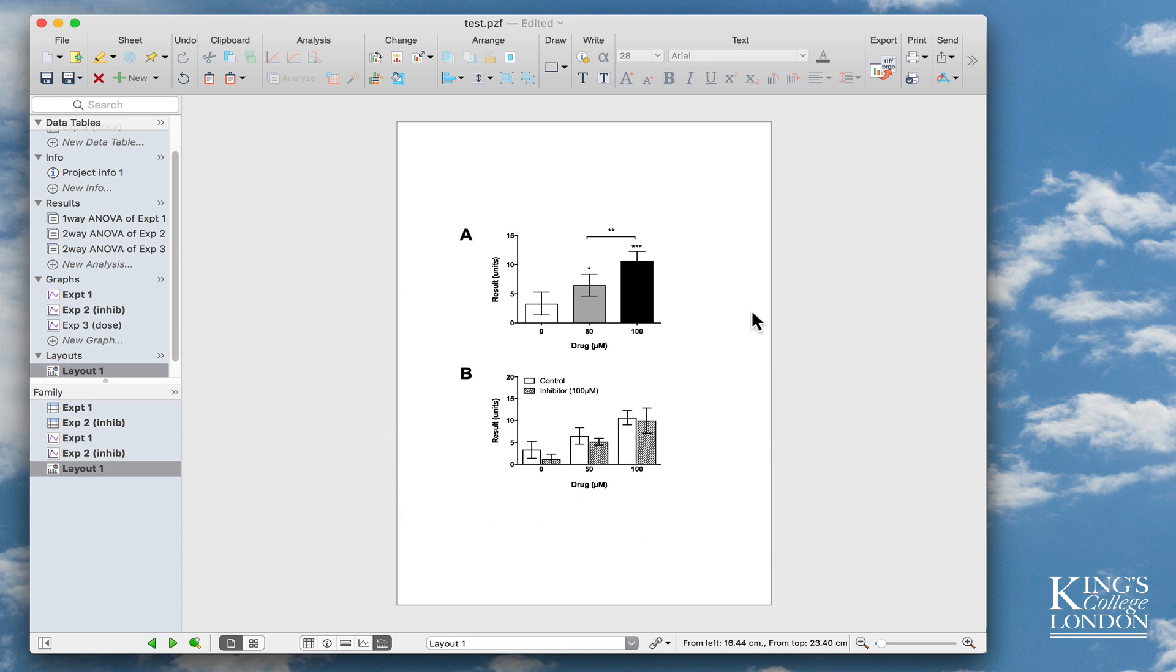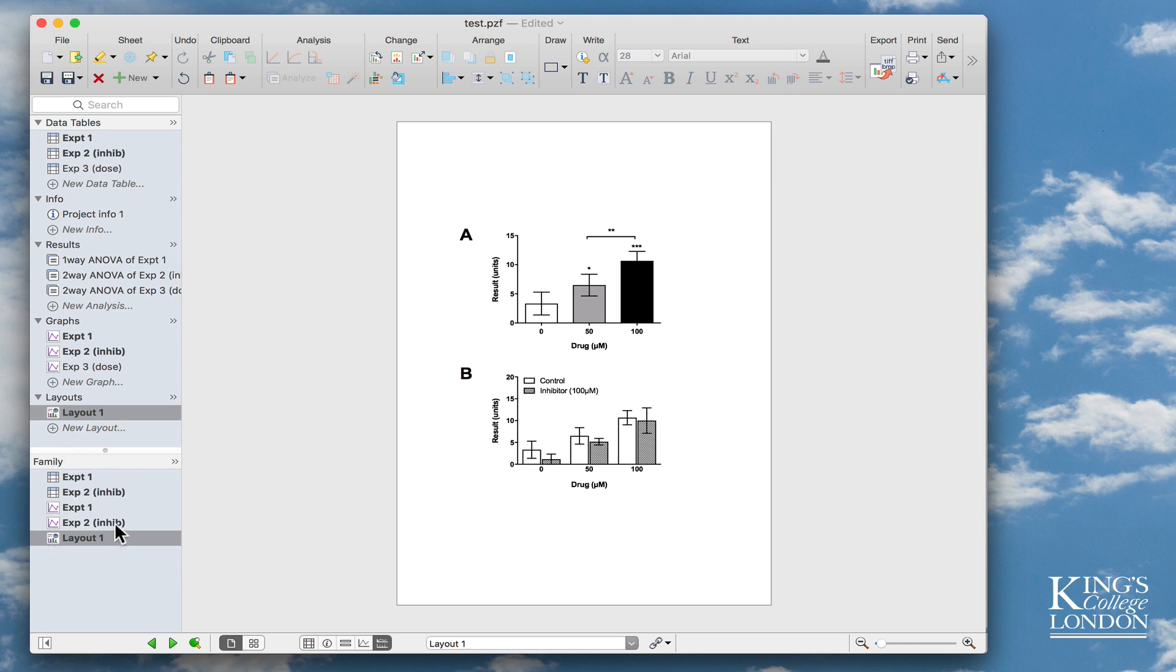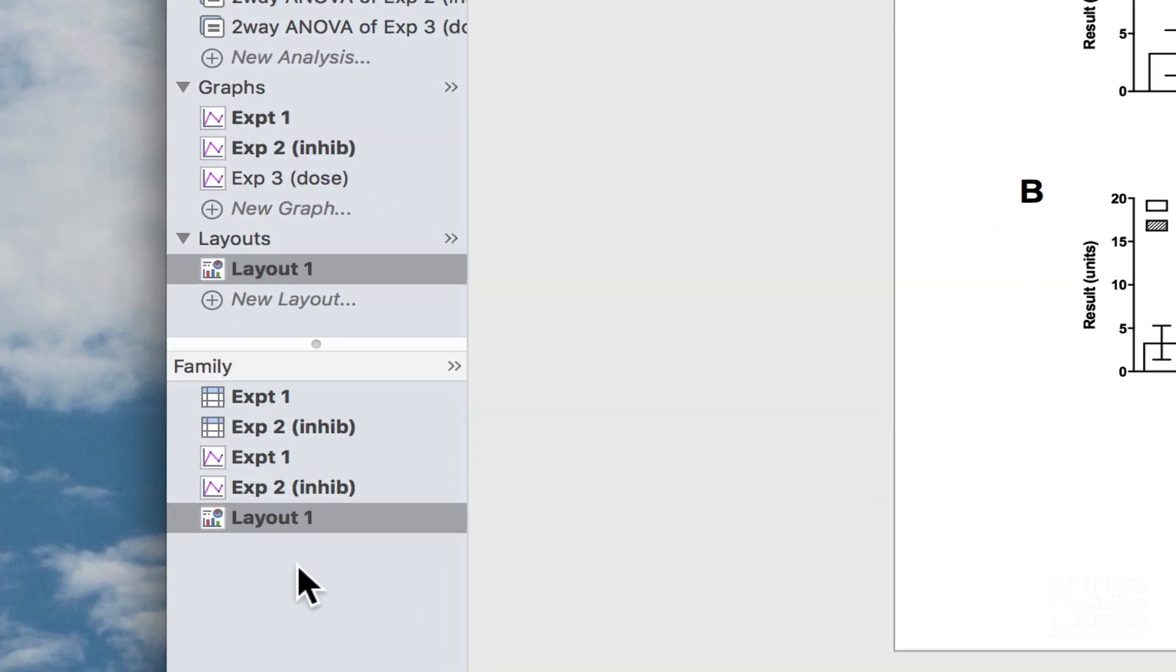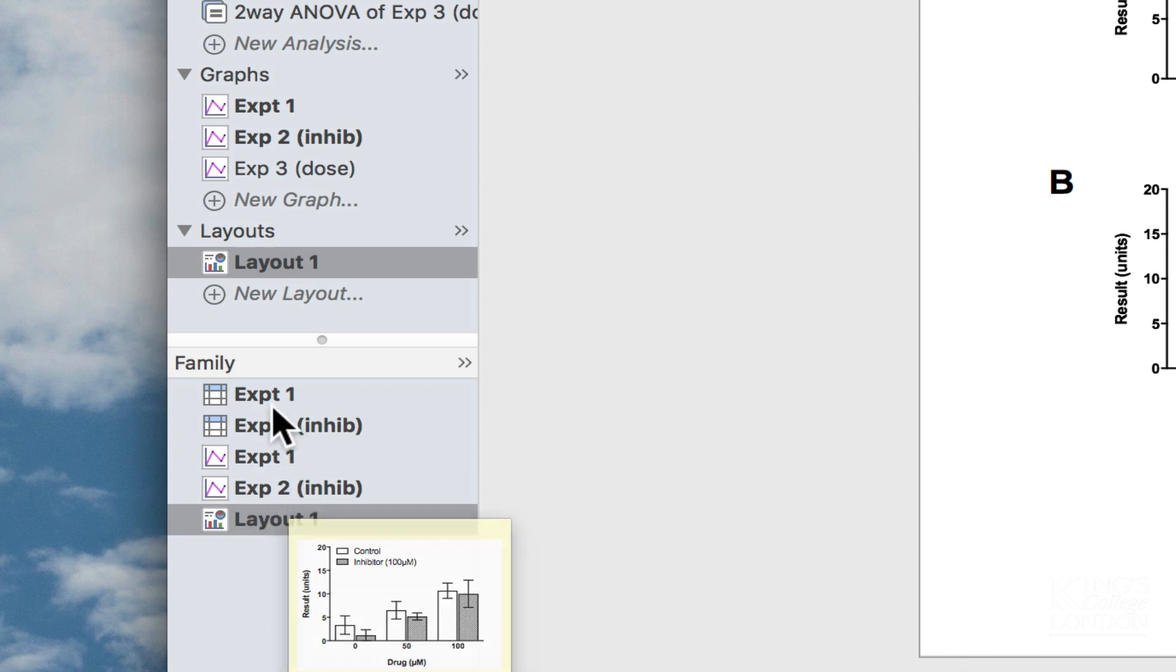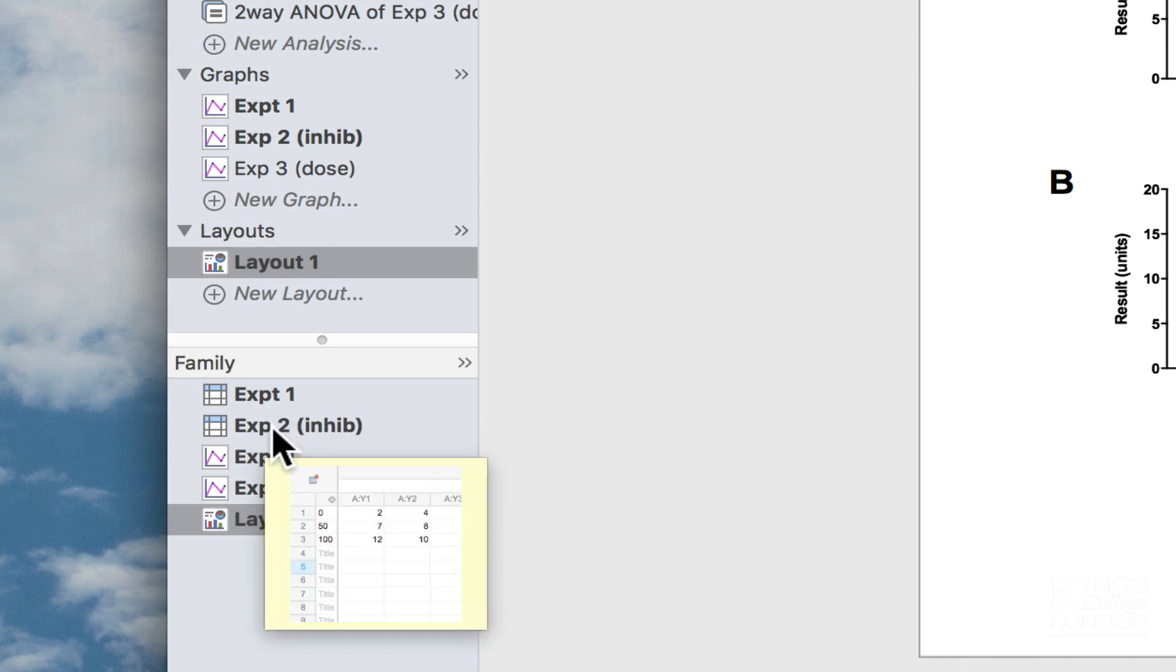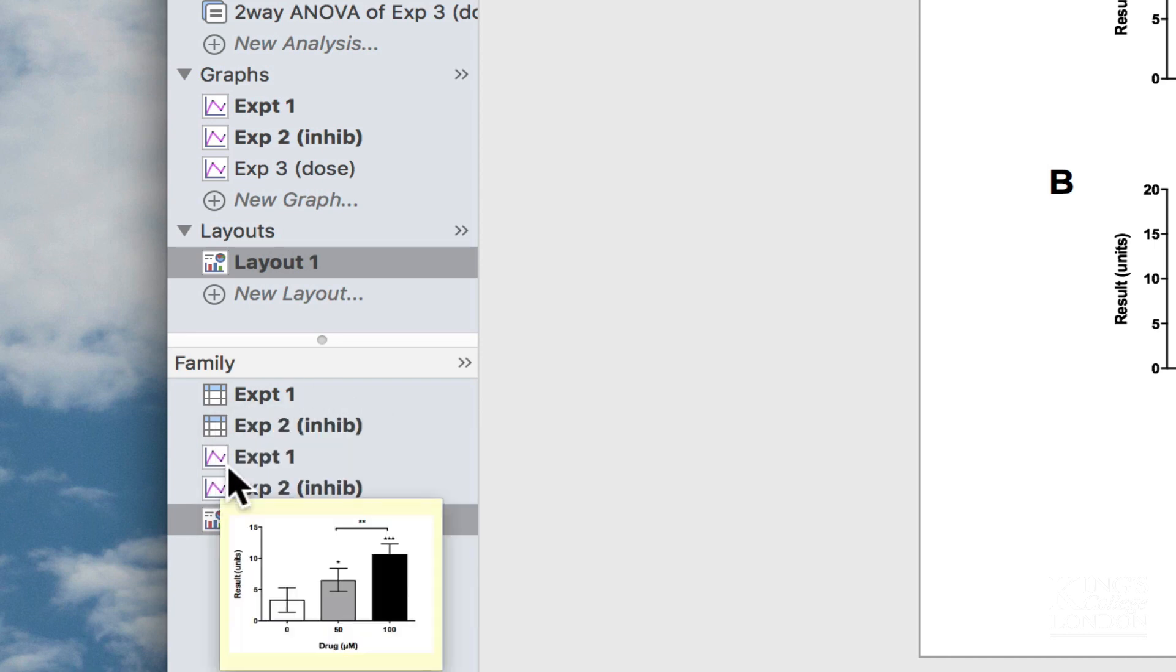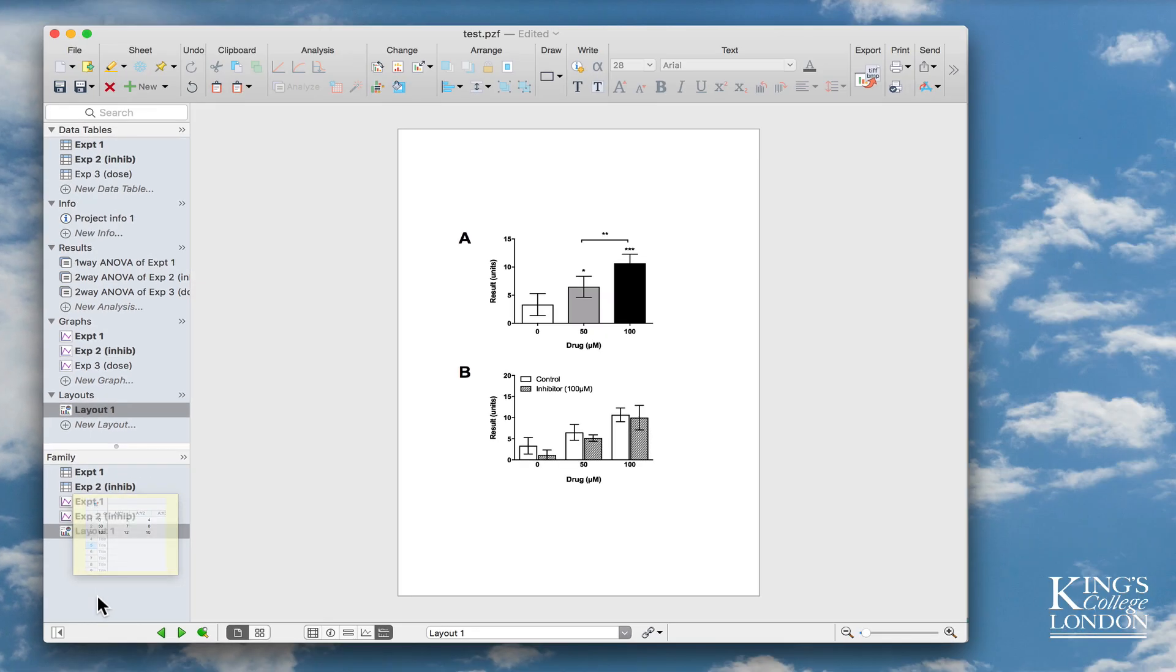We've got very similar layout of buttons, but what we have down the left-hand side now is this little draggable family section down the bottom, and the family section shows you everything that's related to this layout. So I'm selecting layout number one, and I can immediately see there are two graphs called EXP1 and EXP2, and I've got the data tables for EXP1 and EXP2 shown in this little family selection. This is a really handy feature, and I applaud GraphPad for including it.